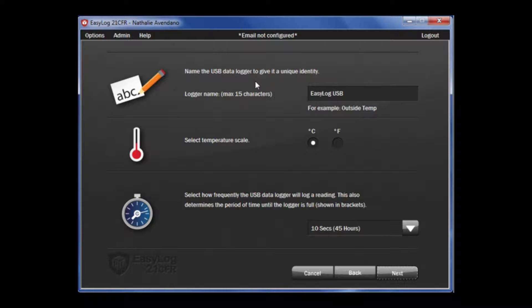You are presented with a number of options. First, you can give each data logger a unique name. This will help keep track of the different data loggers you may have.